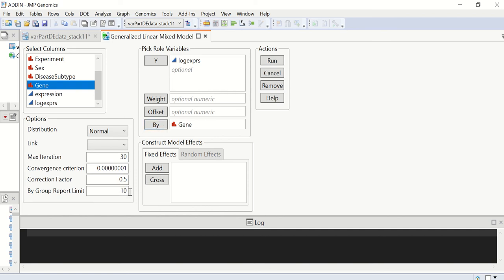we're no longer outputting the report for each of the subgroup. Instead, we will generate a summary table and a volcano plot.